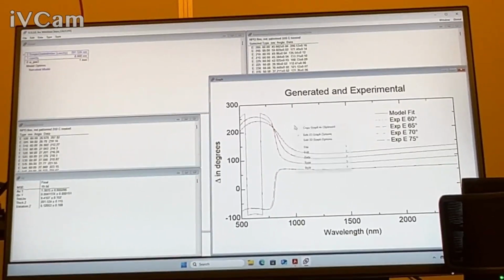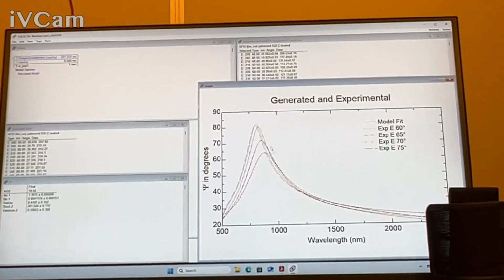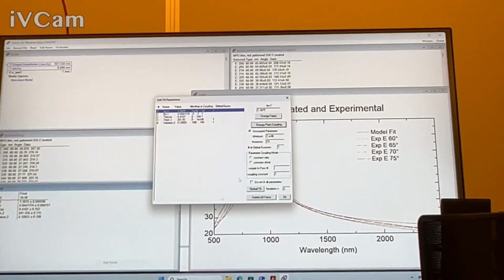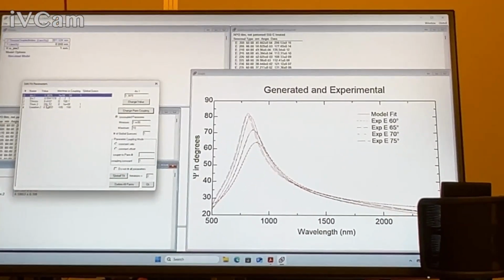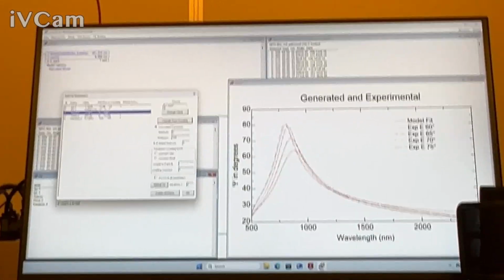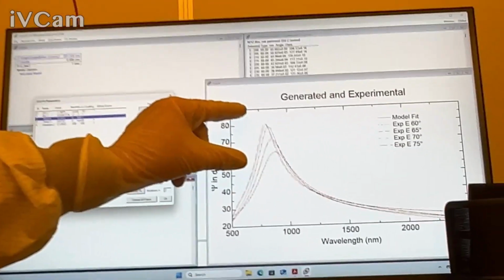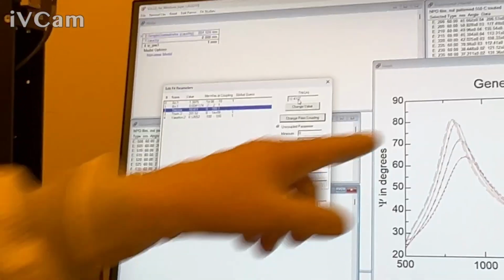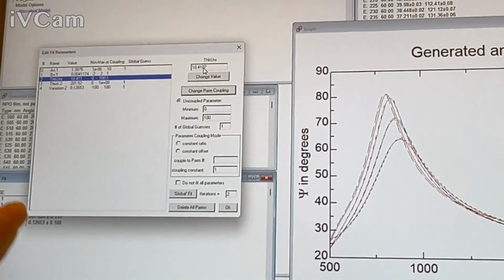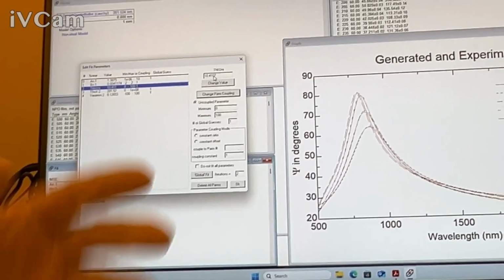What I will say is that if you have depolarization present, you saw how that influenced. So as I influence this, we could look at this graph here. As I, for example, gave it more or less thickness non-uniformity, you see how that's going to affect those peak-to-peak heights. That's going to dampen those. So the influence of actual non-uniformity is going to show up here. It's just whether it's dampening because it was non-uniform or if it's dampening because your index was different. It's a little bit harder to know if you don't have the depolarization.